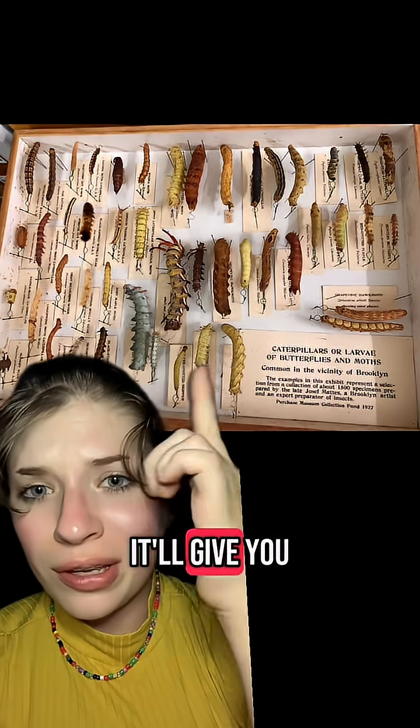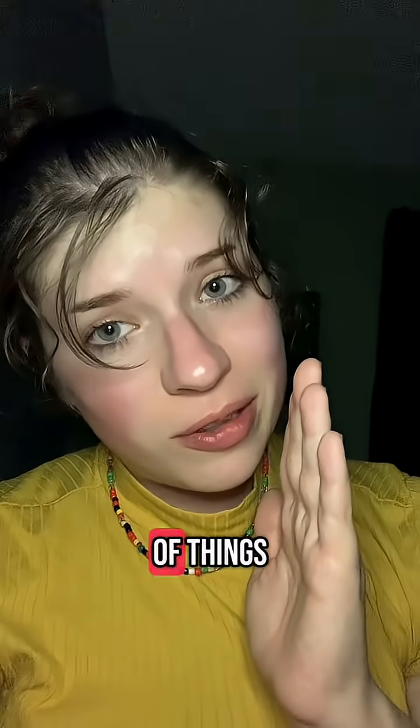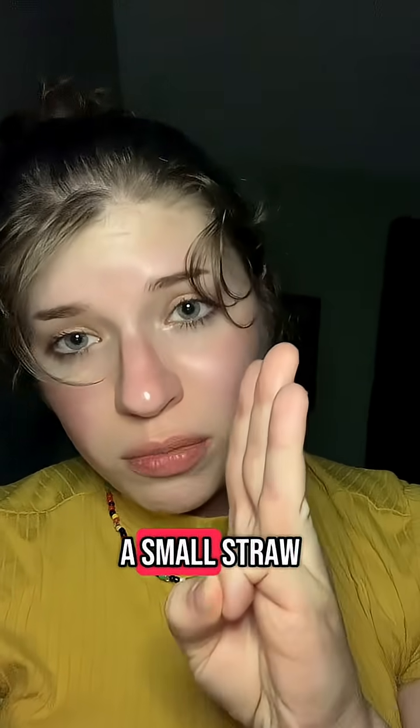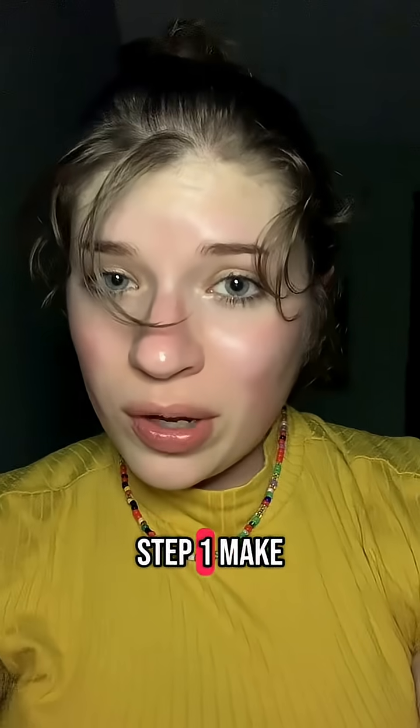It's going to look a little something like that — I'll give you an end product, a little something like these. You're going to need a couple of things: a deceased caterpillar, a scalpel, a small straw, and a heat source.